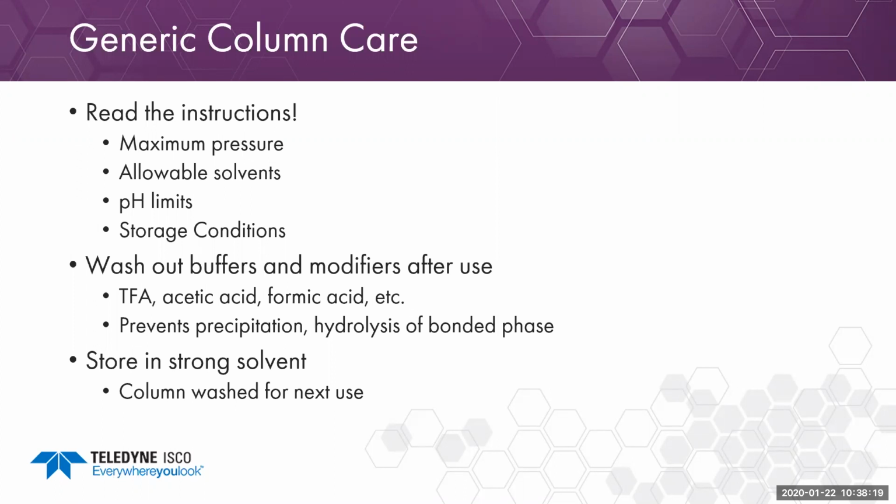It should also tell you what allowable solvents you can use on it, pH limit, so if you're using modifier, what pH range you can get into. And they should have storage conditions located on it.